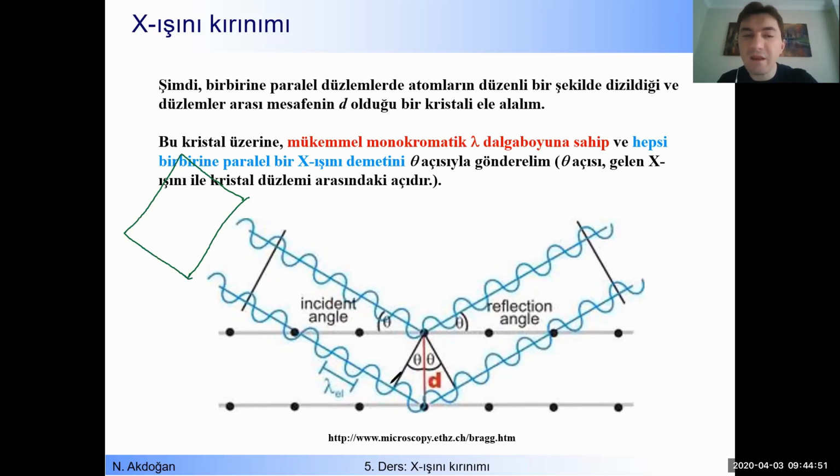Of course, during the X-ray experiments, as I explained during the last lectures, we use high energetic X-rays. Here, for example, in X-ray diffraction experiments, usually the energy is more than 8 kilo-electron volt. For this reason, the interaction between the X-rays and matter is mainly dominated by elastic scattering. Okay, so we have discussed this one. But of course, there is also a very small amount of absorption during that experiment. So here we have a detector.